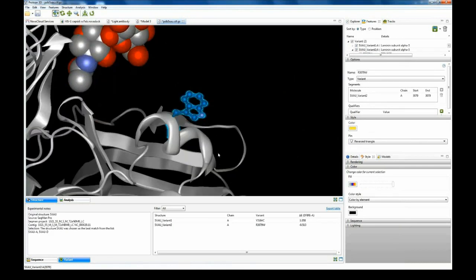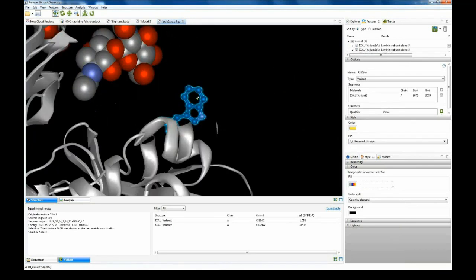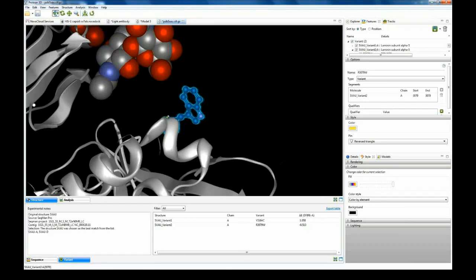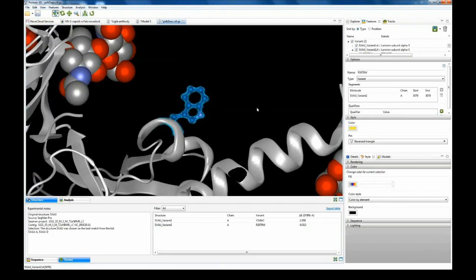Looks like this is possibly stabilizing. It's below our absolute value of 1 change that we would say is significantly destabilizing or stabilizing. But how would you gain insight from a negative 0.5 like this, Matt? This looks like it's on the side of what you could say is stabilizing.